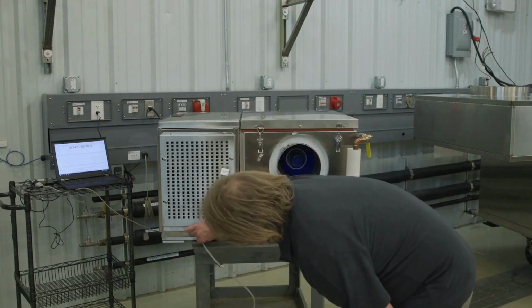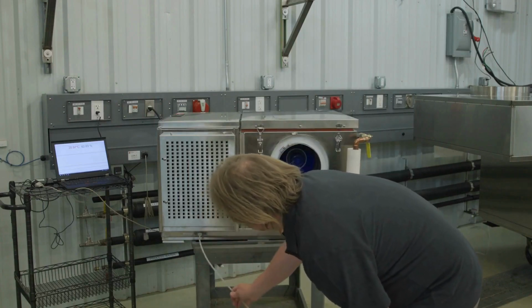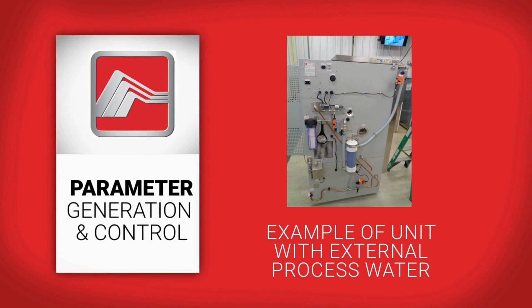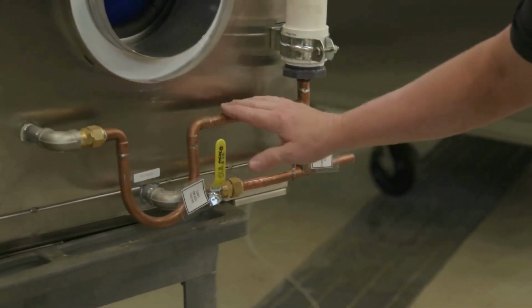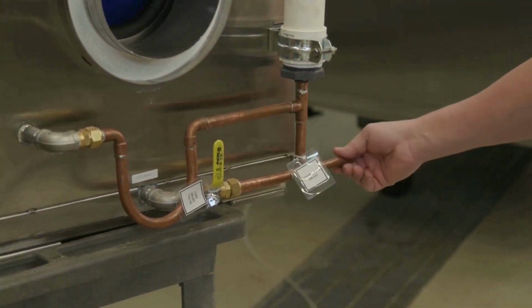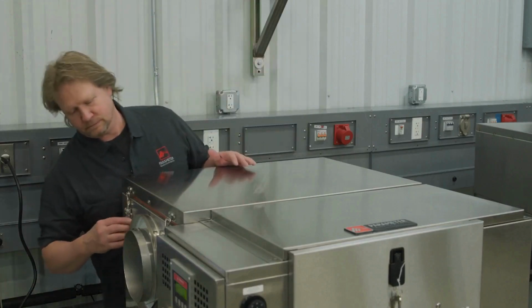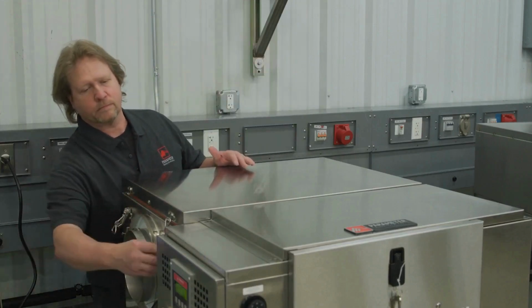Verify that process water is properly connected, if applicable to your machine. Inspect the external process water filters. Make sure that the condensate drain is connected to an open drain. Ensure that the sump pump is fully functional.